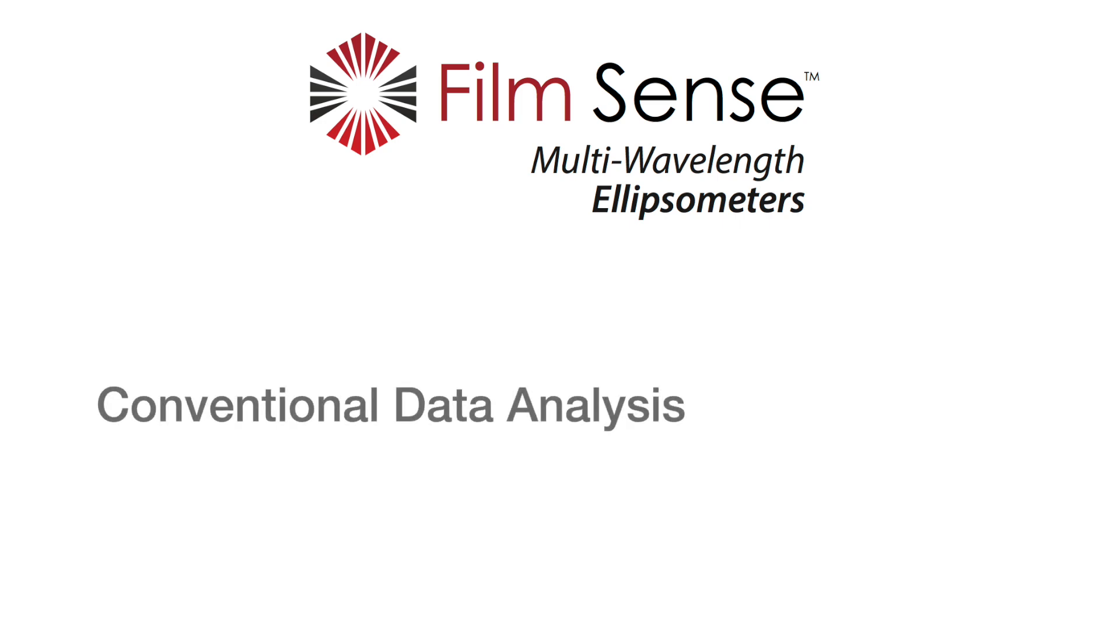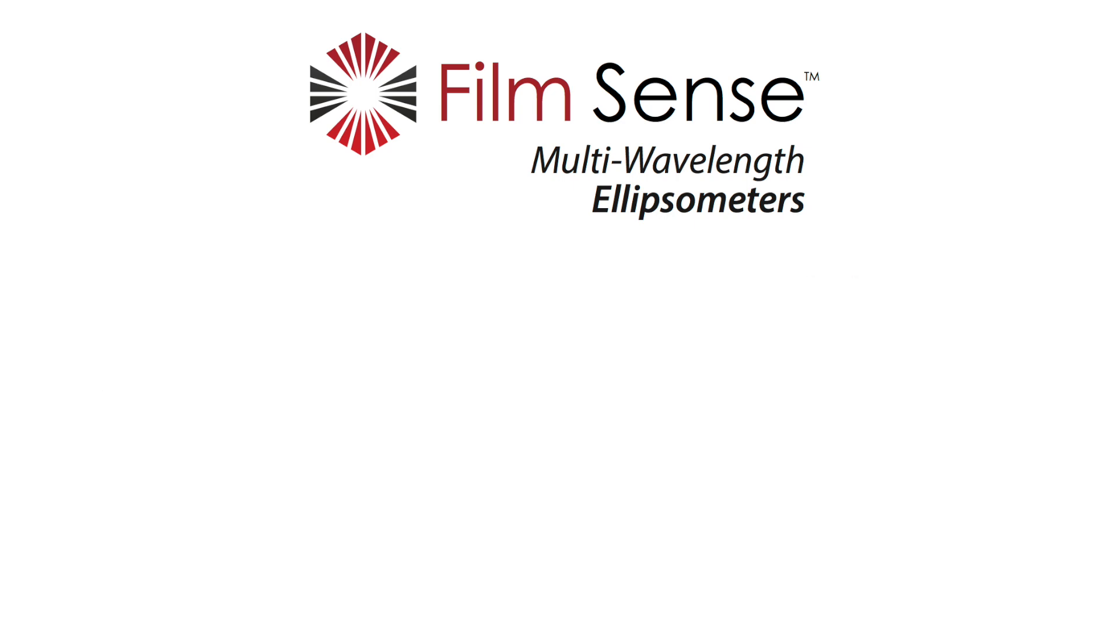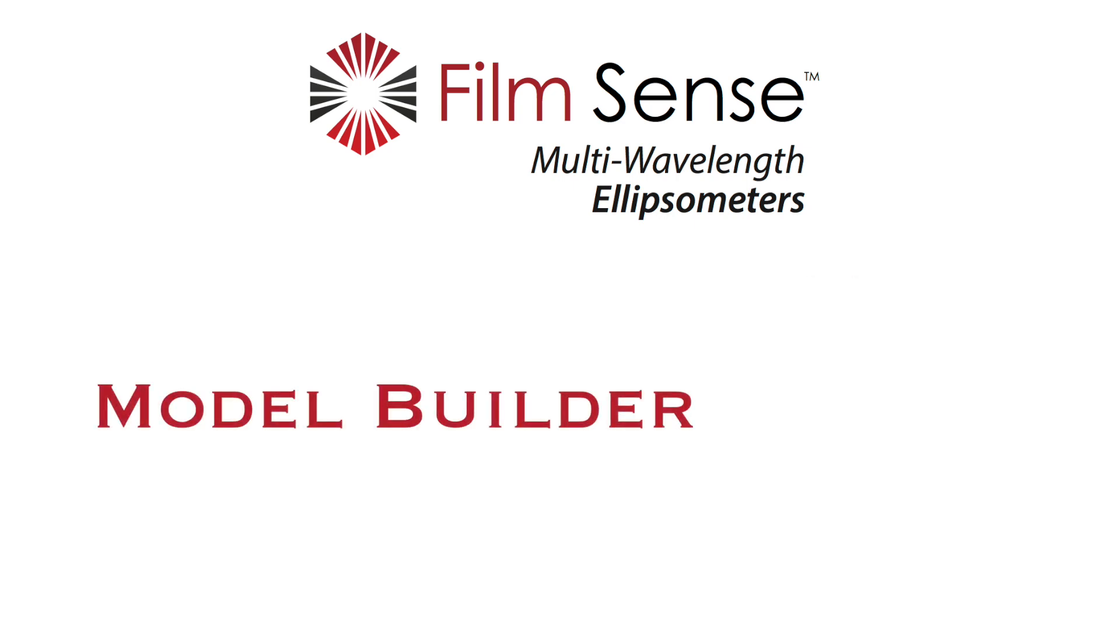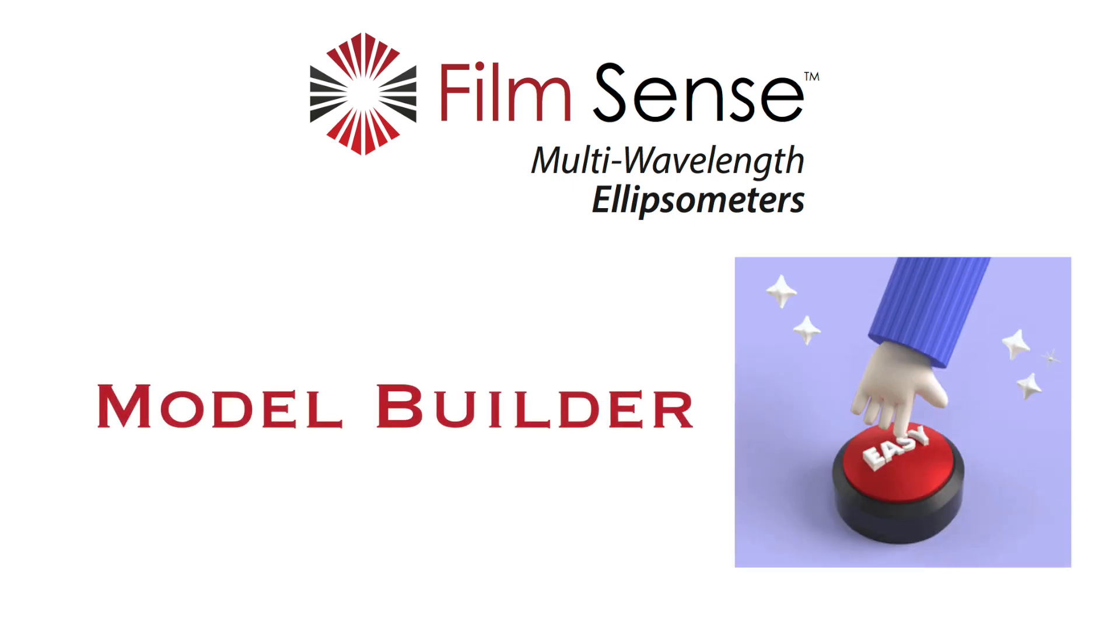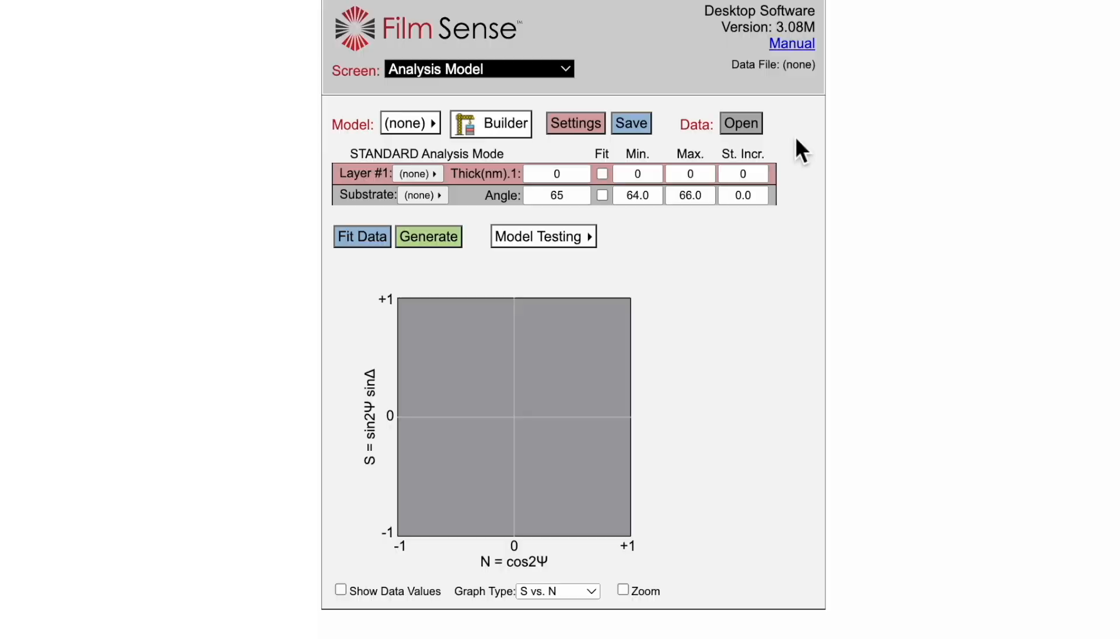Analyzing ellipsometric data can be hard, especially for new users. This video demonstrates how the new FilmSense Model Builder feature automates the process of building and testing analysis models over a wide range of thin film applications.